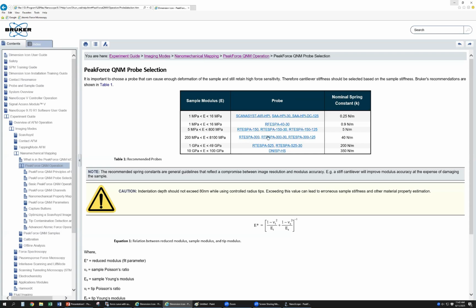Okay, you load this probe. You test first. If the depth is a little bit off, you change a little bit the force set point. Wow, the depth is already 100. That means the material is soft. Then you change it to this probe. Okay, if it is more hard, you change it to this one. Okay, so that depends. If you never know, you just try from the middle one.